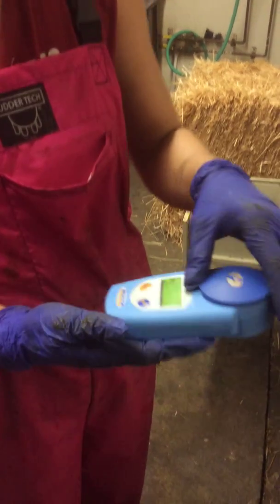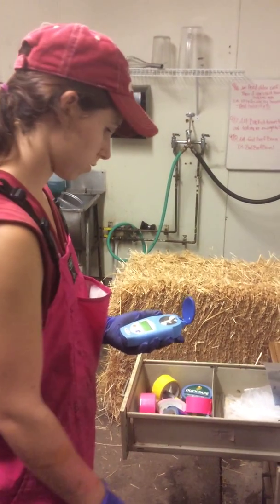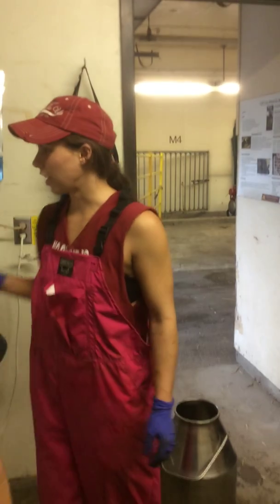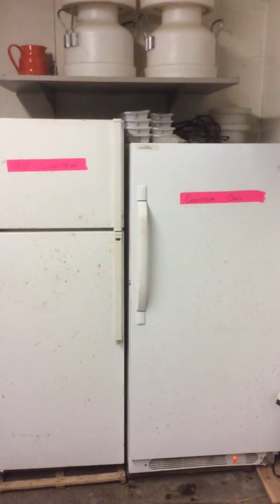Anything below 22 can then be tossed — right down the drain. We only save 22% and up, and it goes on the top shelf. Colostrum that is 22% and up can be stored in the freezer on the right that says colostrum only. The freezer on the left says no colostrum — don't do it.